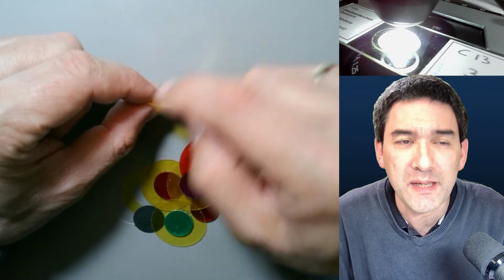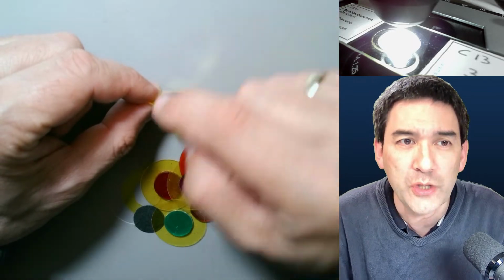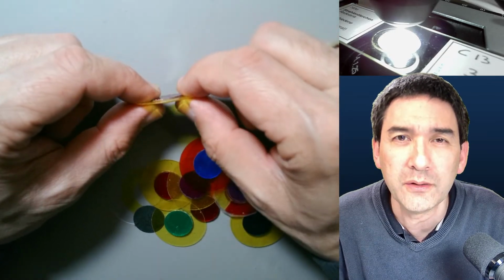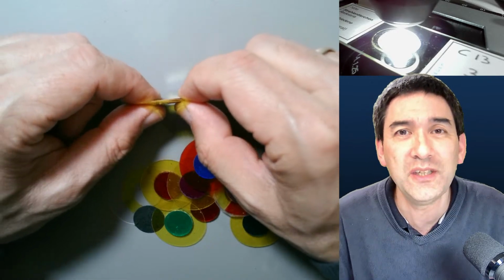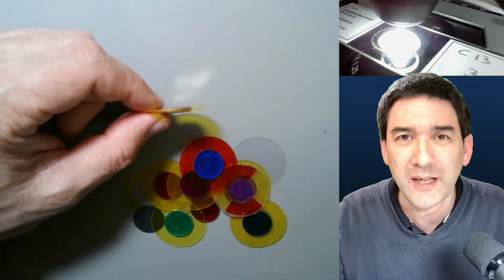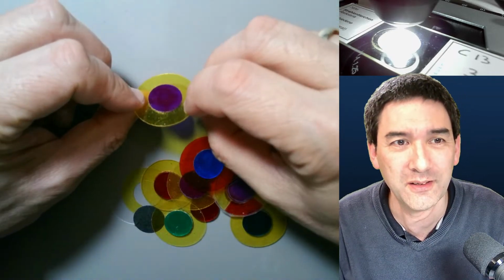But if there is a specimen in here, then the light will jump off from the specimen into the objective. So the yellow light here from the side will illuminate the specimen from the side. It's a little bit like if you are in a dark room and you have a flashlight, and then you see the dust flying in the lamp of the flashlight. The dust will also appear to be bright on a darker background. That's because you're not shining the flashlight directly into your eyes. So that's a little bit the principle here.